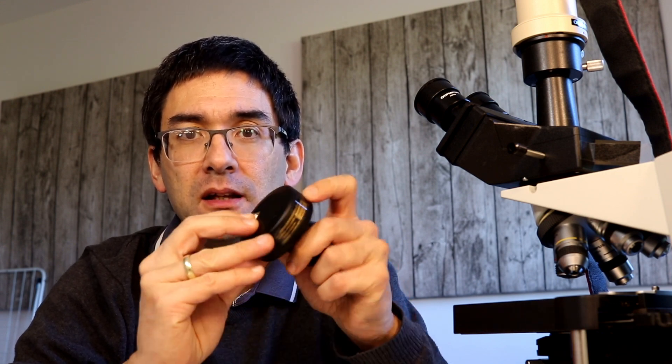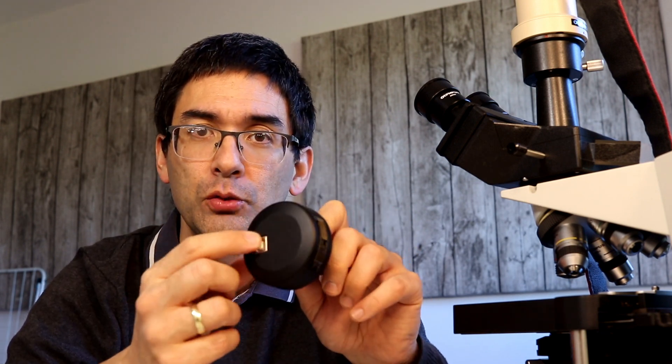There is a problem with these older cameras. The problem is that it's got USB 2.0. More modern ones have USB 3.0, but this one here is still USB 2.0, and this one is too slow to capture HD video. That is a disadvantage because, for example in my case where I do YouTube videos under the microscope, I want to have a proper frame rate and a proper resolution, and USB 2.0 is simply too slow.